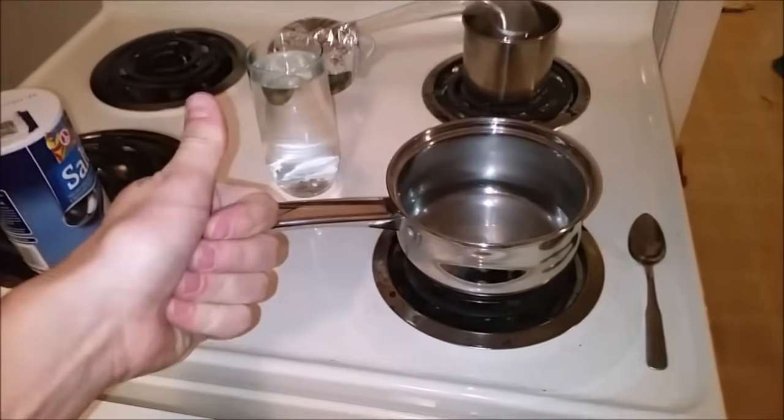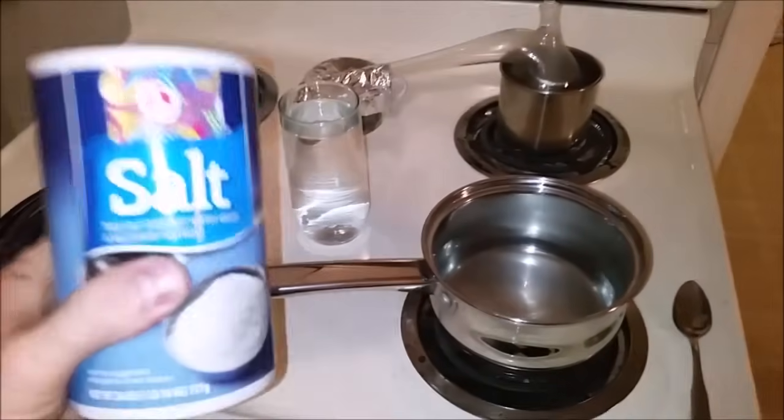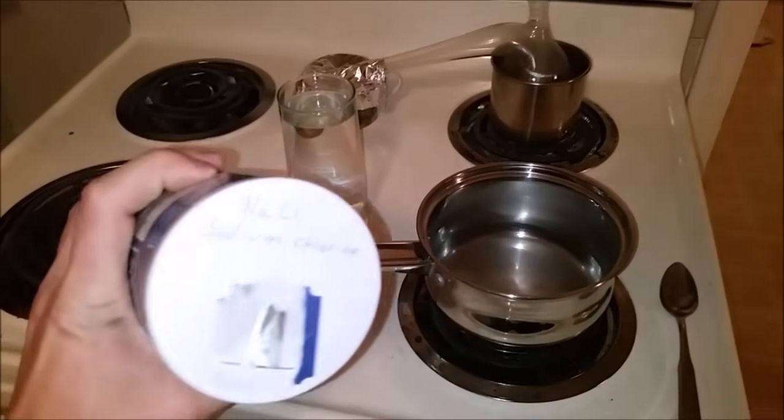Hi everyone, welcome back to Cody's Lab. So today I'm going to be making sodium hydroxide using salt, the regular eating kind.